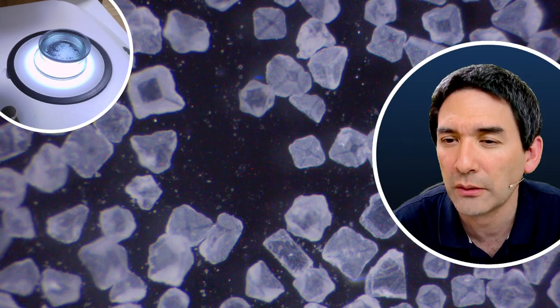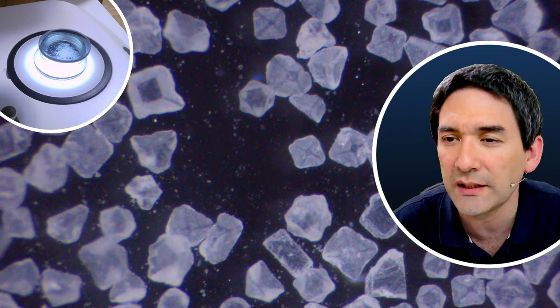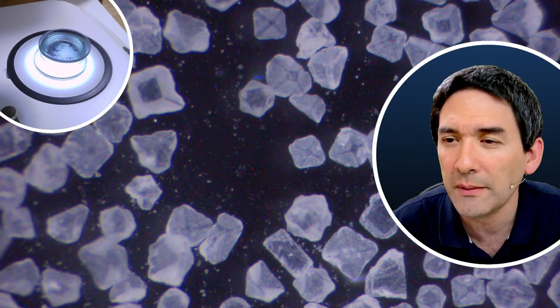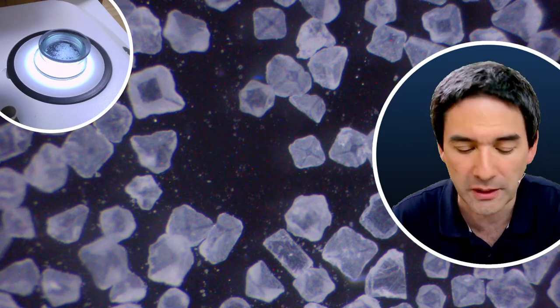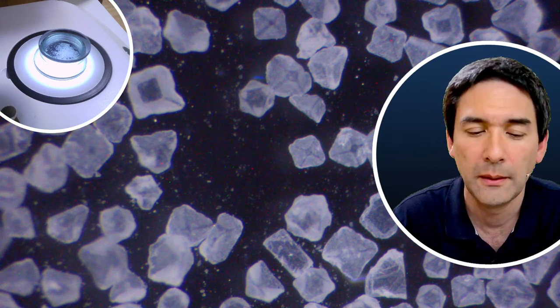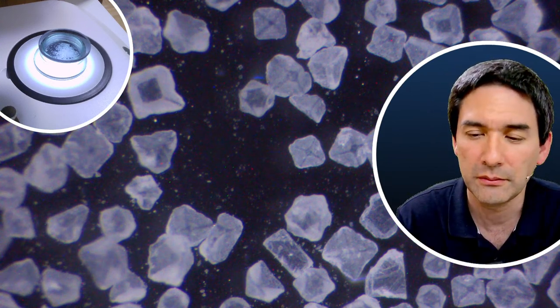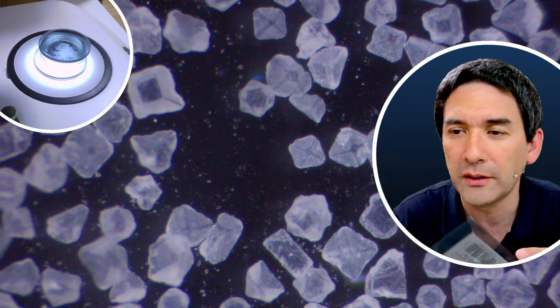So I'm trying to learn. They can be found in broken LCD screens. Yes, that's correct. What elements is the polarized filter? I don't know, it's a plastic filter, but how the polarized filter is actually made, I don't know. Essentially, it is a commercially prepared filter, and they are quite common.